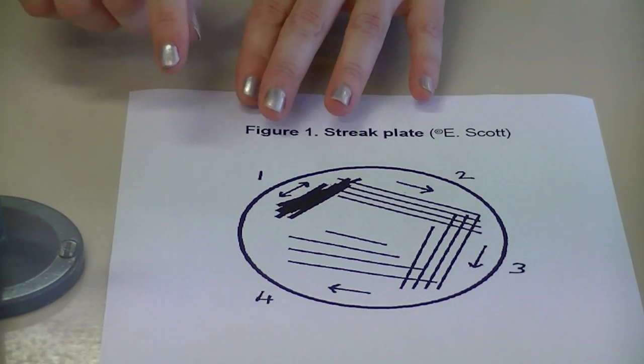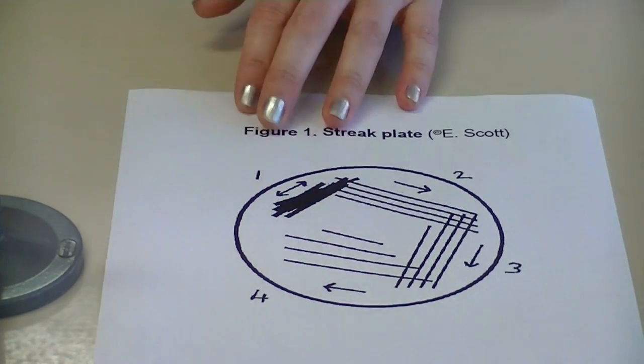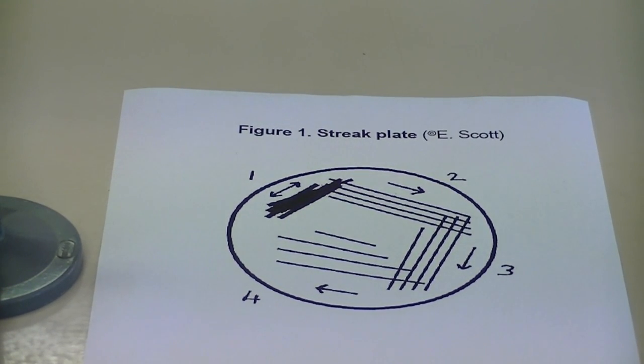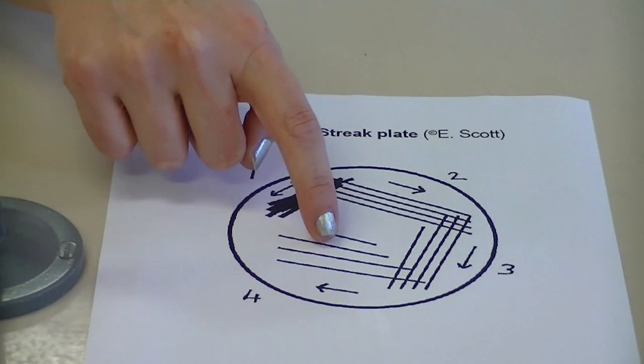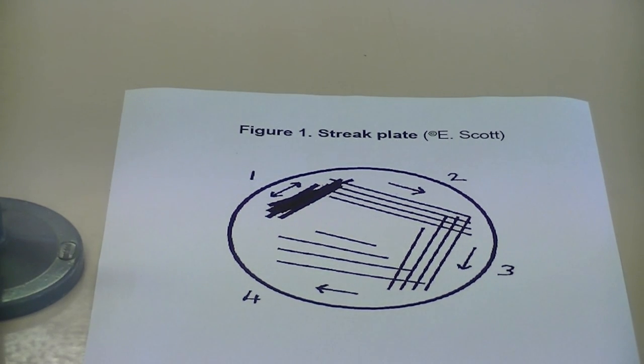In the diagram, you can see in the quaternary steps that there are streak lines which don't intersect with the tertiary lines — that is one way of performing the streak plate technique. With your quaternary lines, you could also perform a vertical line and a zigzag into the middle of the plate. There are a number of ways that you can do this and both ways are acceptable.